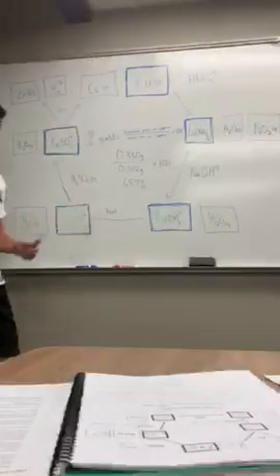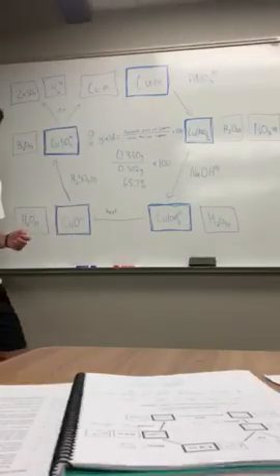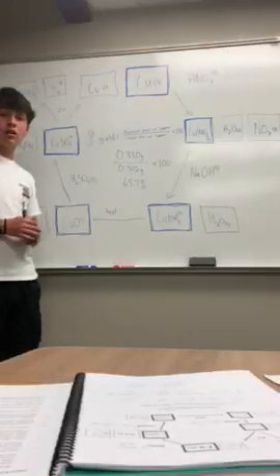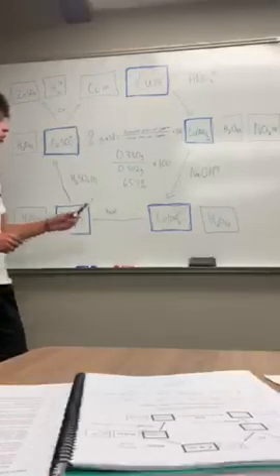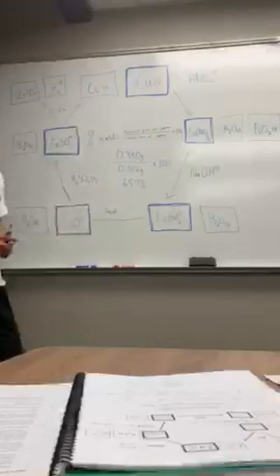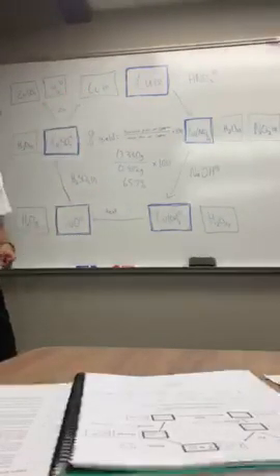We got a percent yield under 100, and this could have been because while we were decanting the liquid, it was very hard to make sure the liquid that was decanted was 100% water, and we could have decanted a small amount of copper out, which could have then affected the final mass of our copper.